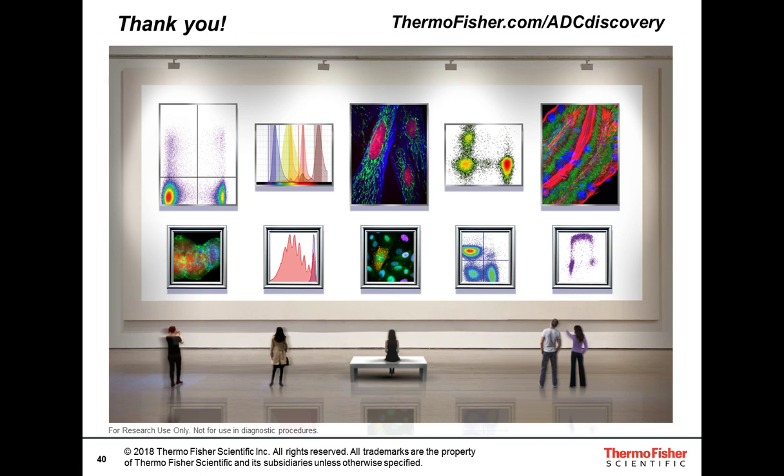With the Zenon labeling, it's much the same, where you could have a whole suite of things present in your antibody, but because of the high affinity and specificity of the Zenon reagent for the Fc domain of IgG antibodies, there's again no need to clean up those antibodies either. They can be directly labeled in whatever solution they may be in, and proceed to your cell-based experiment. So good question, thank you.